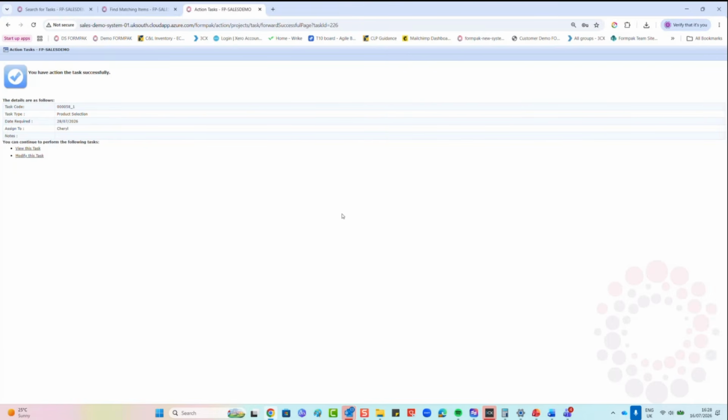So on each task, you might want to enforce a suitability check, which is performed once the task reaches a certain status. So if any items are not compliant, it will not let the user progress any further unless the non-compliant items are either removed or you have the relevant permission to carry on. So this is a good way to ensure regulatory compliance. Additionally, you could include a regulatory task to check for very specific requirements for the product, which may include, for example, no hazard pictograms on the product label or limit allergen on the packaging.